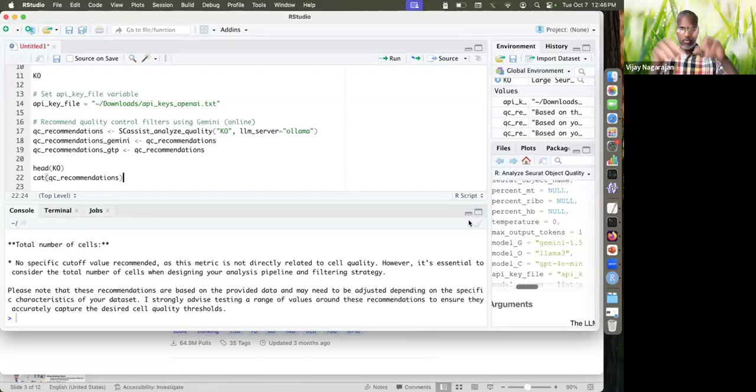I think the version that we use is also the low end version of the actual GPT. I don't know if I answered the question. We are using APIs, not the ChatGPT window, but if you run ChatGPT for SCassist, I'm going to assume that if you're not a 24/7 bioinformatics person, if you're running this analysis for your research for one experiment or two experiments or even for 10 experiments, your API calls will fall under the free quota.